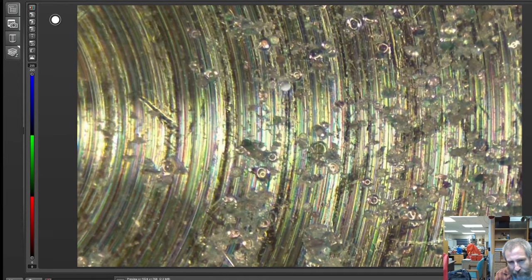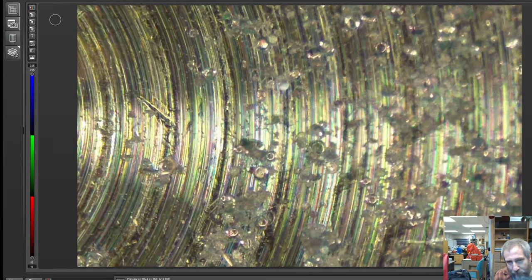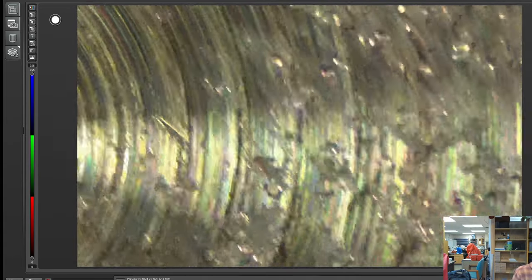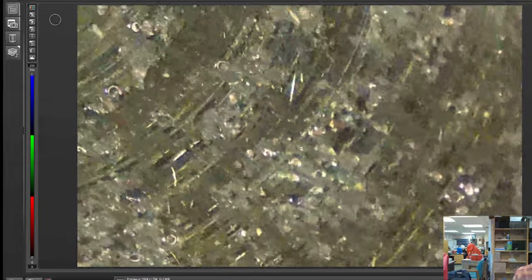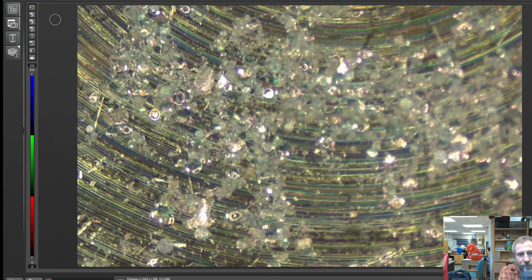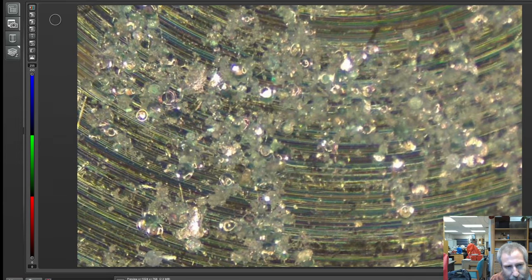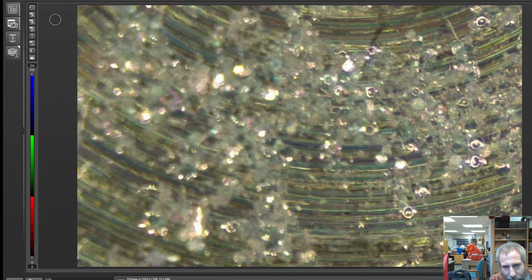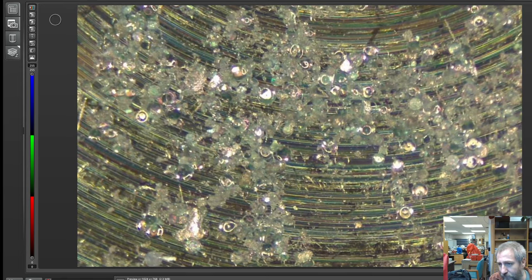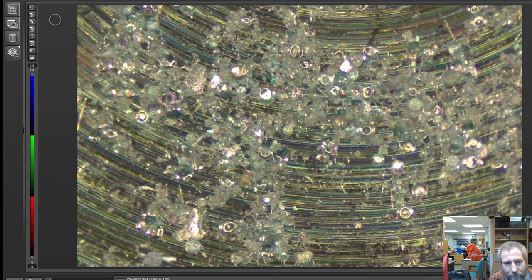And sometimes people say, oh, can you see diatoms with your naked eye? And I say, no, but you can see them with the stereomicroscope, just the big ones, of course. The little ones we can't really see, but all those little circles that you can see on there, I think pretty clearly, those are actually diatoms. So this is the maximum magnification that our stereoscope has, and those are probably some of those big Coscinodiscus diatoms that are on there.